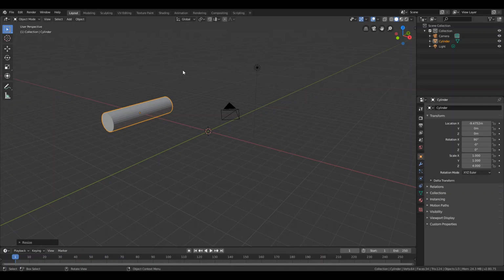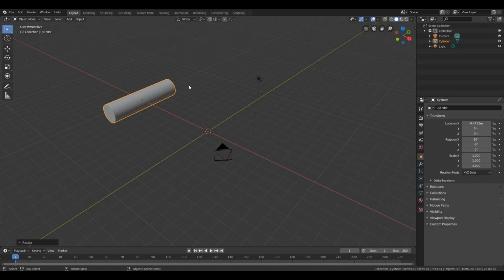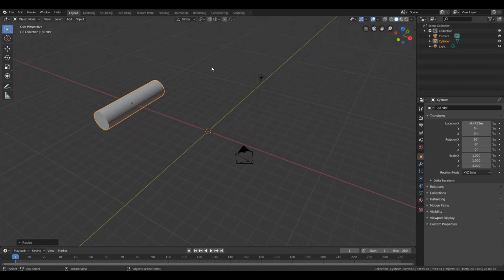I think I will talk about that later, but they are similar, they make scanning lines and those scanning lines illuminate a phosphorus or something surface that we call a screen. Okay, so this is the explanation for black and white CRT TVs and not the colorful ones. So it's an explanation for really old-fashioned ones, but the technology should more or less be the same. But anyway, back to microscopes in our TVs.